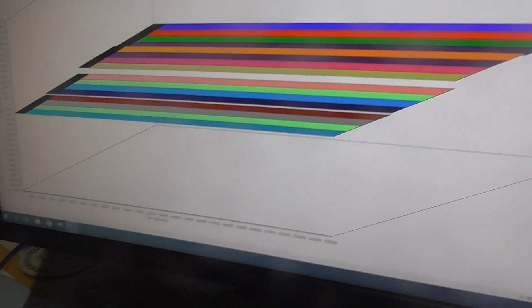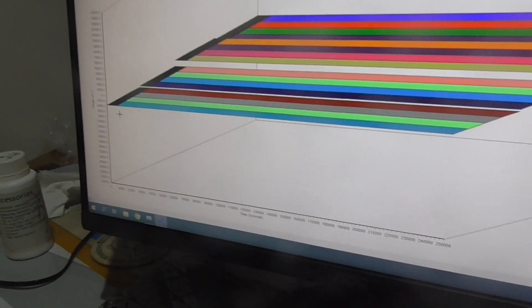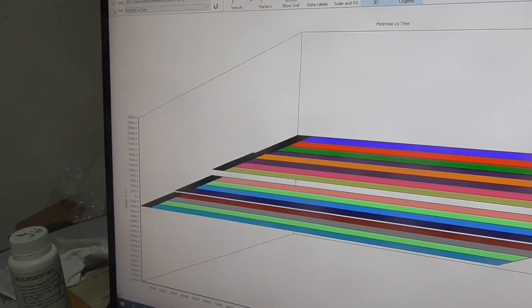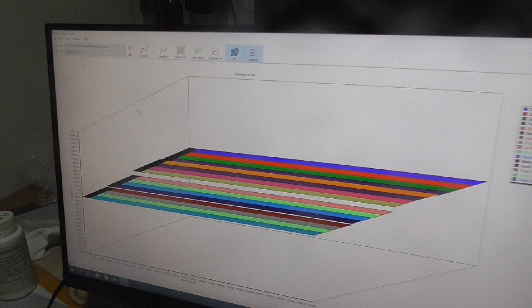reading, this is the 3D scale, and it shows you the graph, how the graph plots.